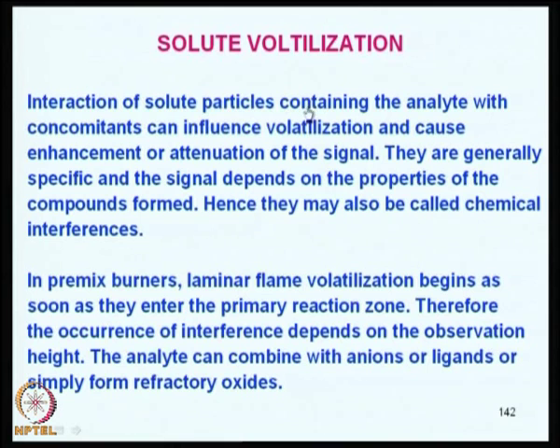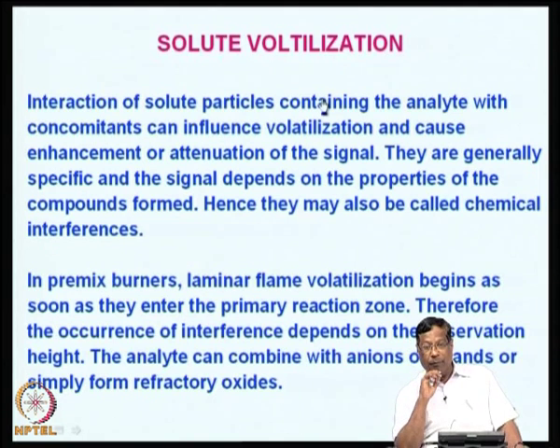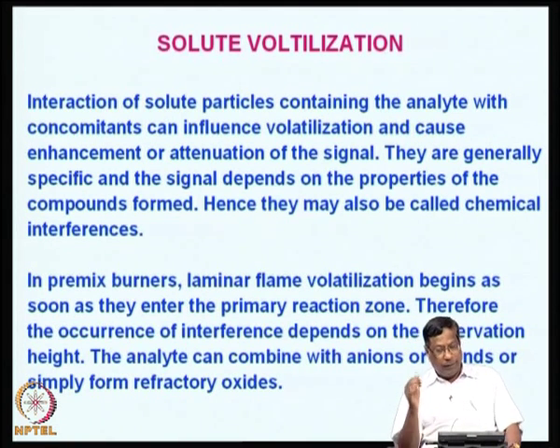Now, we look at another aspect of solute volatilization. You remember I talked about the formation of oxides. The solute part of the sample that is used for aspiration may form oxides instead of decomposing into atoms, because air is generally an oxidizer. There are several elements of the periodic table which form preferentially oxides and hydroxides when they are mixed with water and at high temperatures.